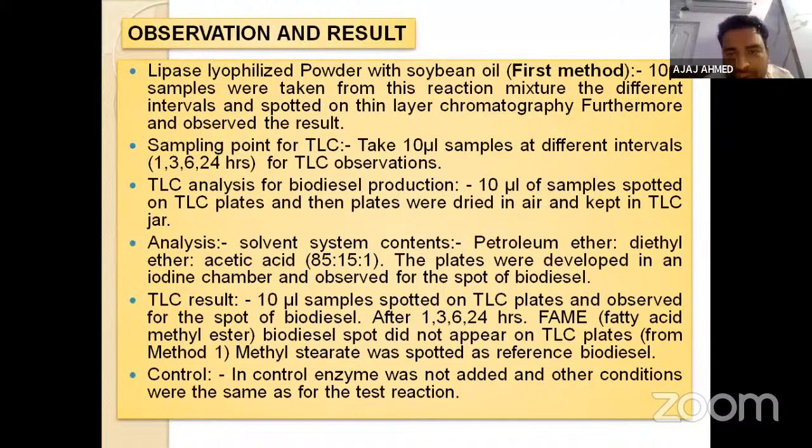Lyophilized powder with soybean oil is the first method. 10 microliter samples were taken from the reaction mixture at different intervals and spotted on thin layer chromatography. Sampling points were at 1 hour, 3 hours, 6 hours, and 24 hours for TLC observation.